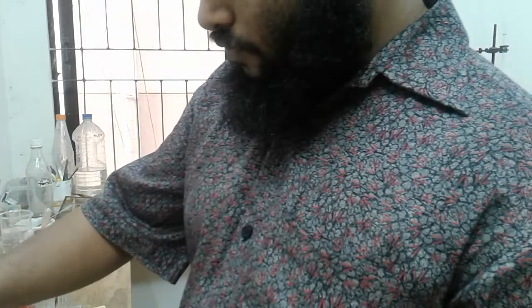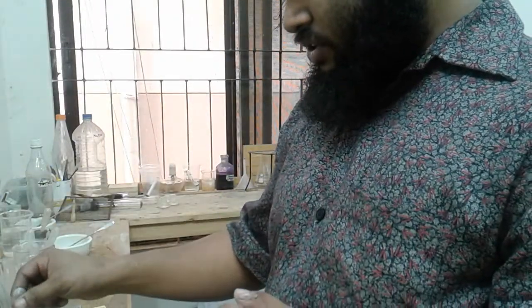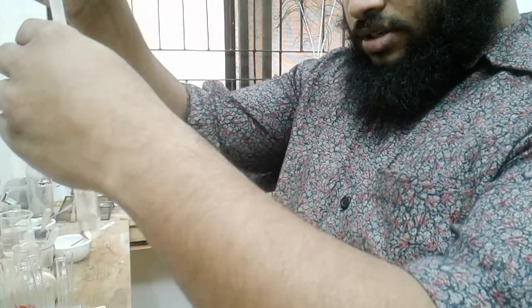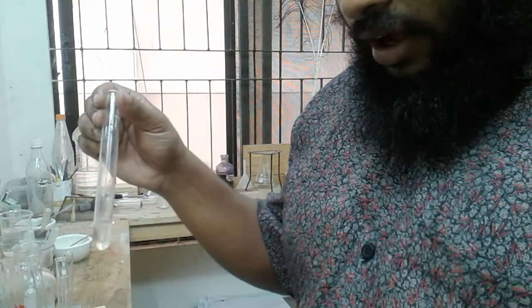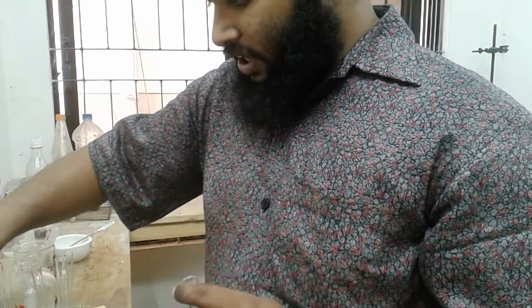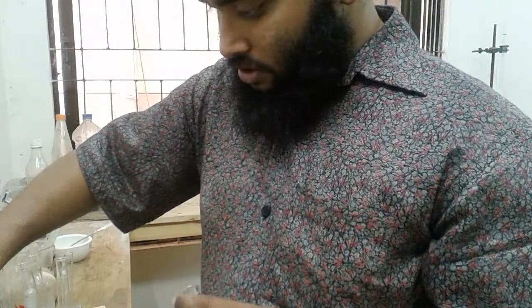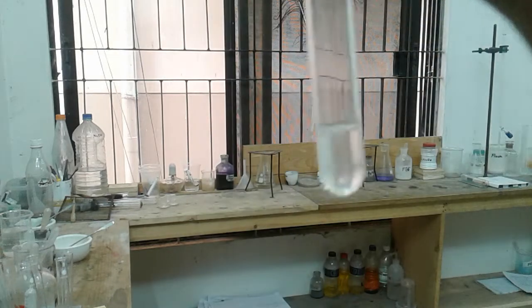So I am now going to do the test on Fa1C. So this is Fa1C. Okay, all right. Then I will be adding sodium hydroxide again. Fa1C, just look carefully.